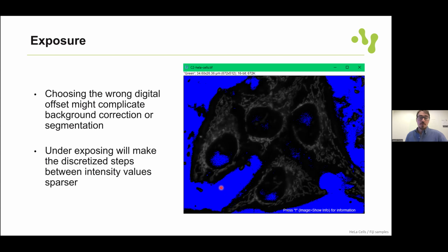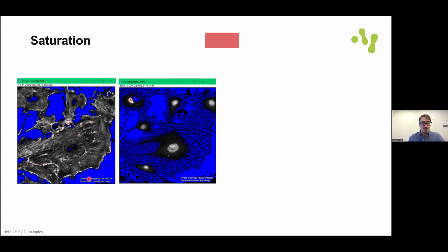But the other problem is that if you wanted to segment your image, you kind of segmented it already during image acquisition. So whenever you put a different sample there, this background level might be higher or lower, and you're biasing your analysis during your acquisition. And this is information lost that you cannot correct afterwards.